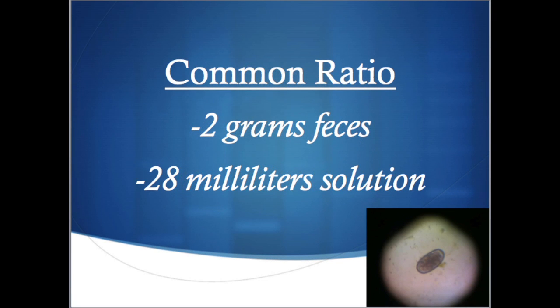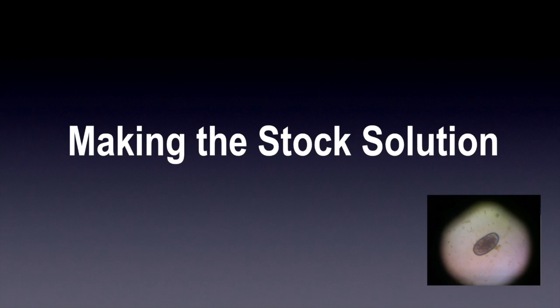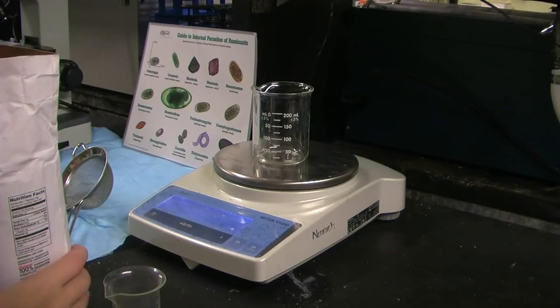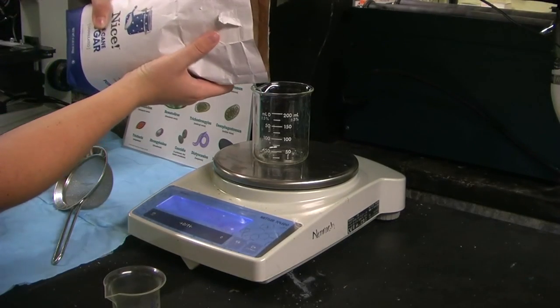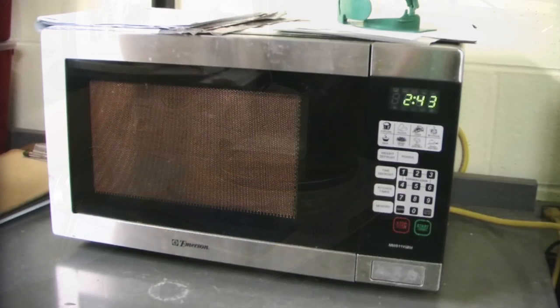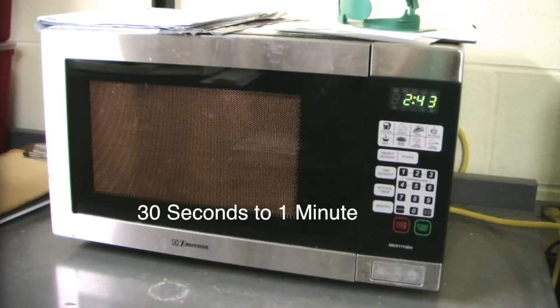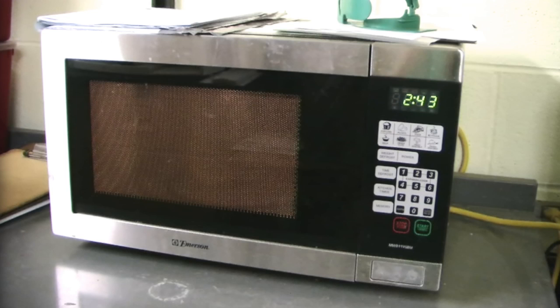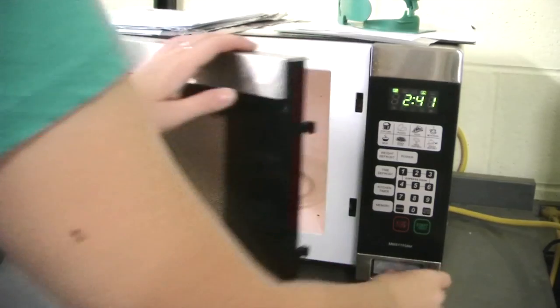There are several ratios of feces to solution that can be used, but the most important is that the volume of flotation solution and the weight of the feces are known numbers. A common ratio is 2 grams of feces to 28 milliliters of solution. Here we'll be using a sugar solution as the flotation medium. To make a stock solution, use 1 pound of sugar with 355 milliliters of water. The solution can be heated in a microwave until the sugar has completely dissolved, about 30 seconds to 1 minute depending on the strength of your microwave. The goal is to have the sugar completely dissolved into the water, not to get it so hot that it becomes warm to the touch.